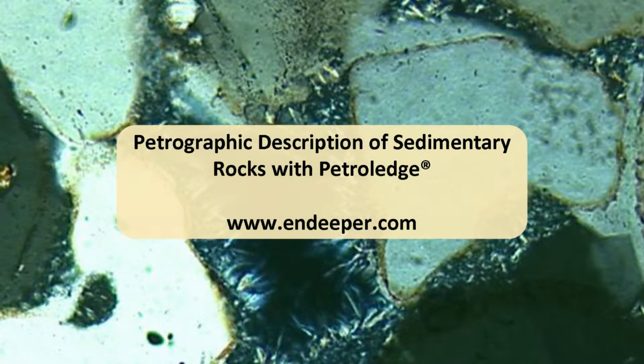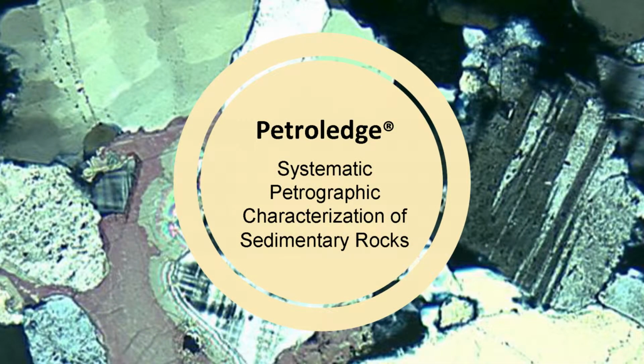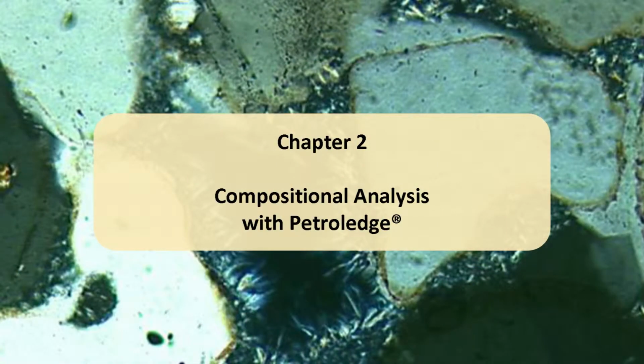Petrographic description of sedimentary rocks with Petroledge. Petroledge system optimizes the workflow for petrographic characterization of sedimentary rocks. Chapter 2. In this chapter, you will learn to perform the compositional analysis with Petroledge.